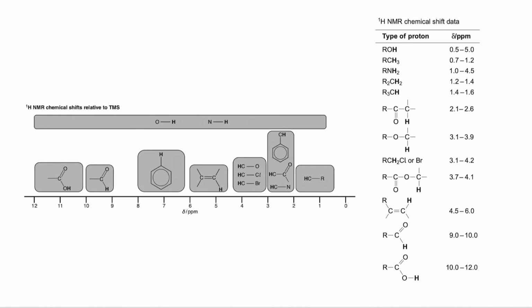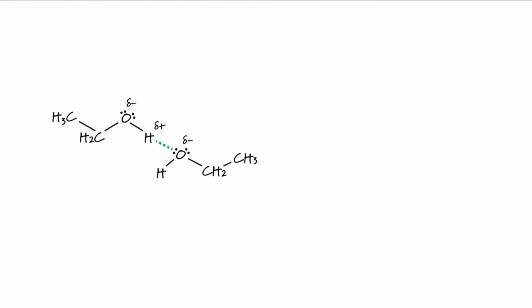The final thing I want to talk about is the chemical shift of protons that are directly bonded to oxygen or nitrogen, OH groups, NH groups. As we can see, we would expect the peak to turn up absolutely anywhere. There doesn't really seem to be a lot of rhyme or reason to it. In addition to the peak for an OH or NH proton, so we're talking about these sorts of protons here, being absolutely anywhere, the peak is often really, really small and quite broad.